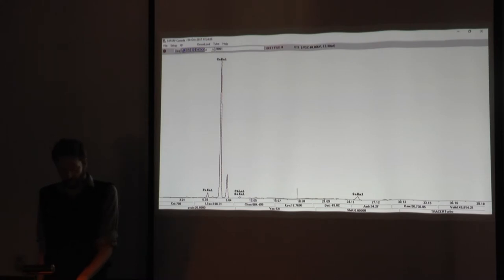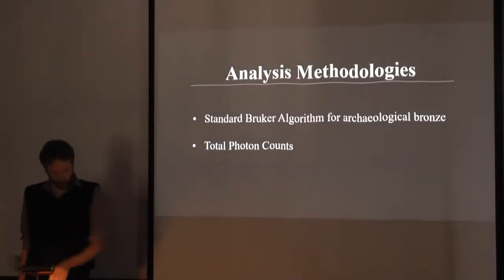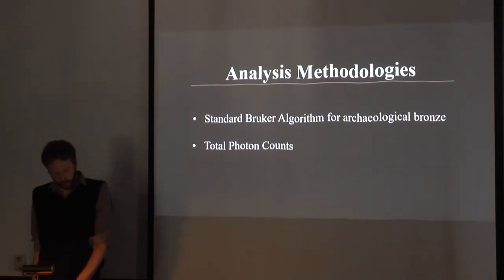The sampling process was conducted in a closed museum space over the course of a single day, and we used two methods to interpret the resulting spectra. The first method is, in my opinion, the least valuable because it is the most deceiving. I was provided with an algorithm from Bruker, the manufacturer of the spectrometer, that calculates the chemical compositions of each spectrum. The algorithm addresses interelemental interaction, distinguishes overlapping elements, and compensates for numerous other variables that might skew the results.